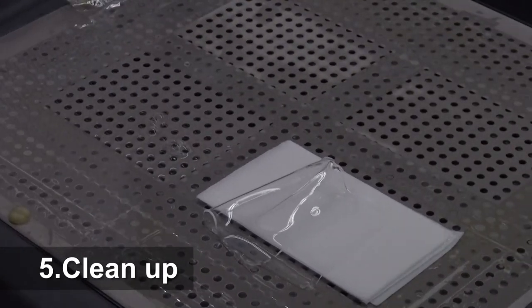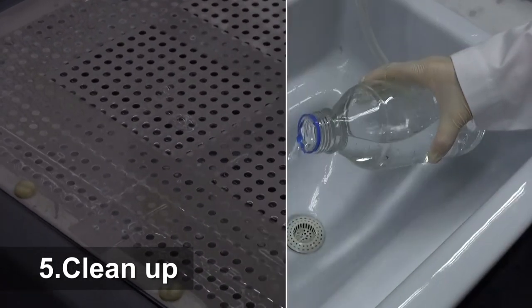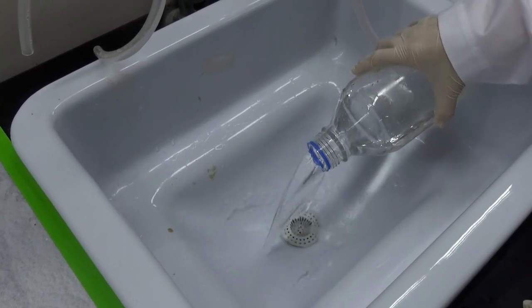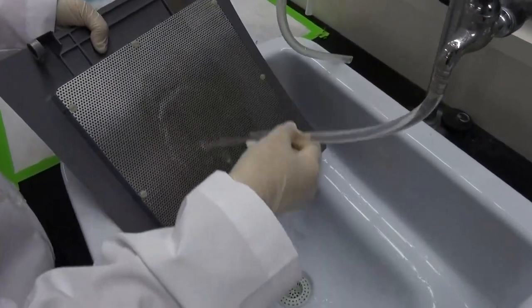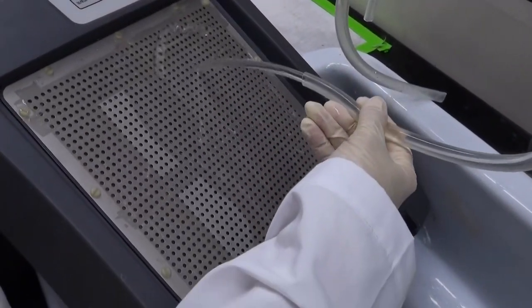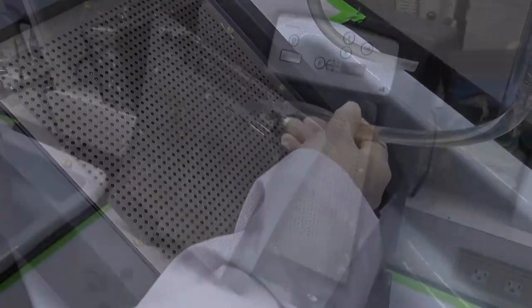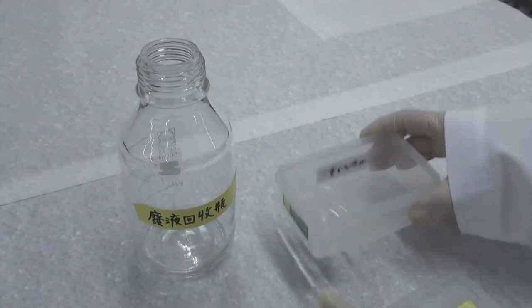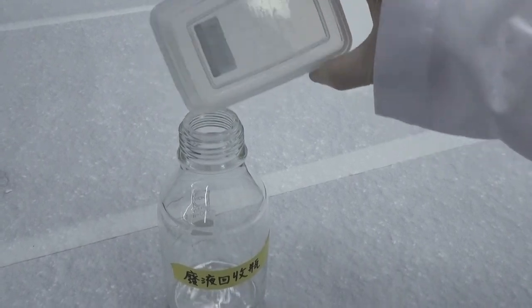Throw away used filter paper and unwanted gels. Empty the water bottle and put the bottle back to its original location. Turn off the power supply. Rinse, wipe, and dry the metal plate as instructed to prevent rusting by residual salts, which can cause poor transfer performance. The liquid waste containing methanol should be disposed of at the designated place.